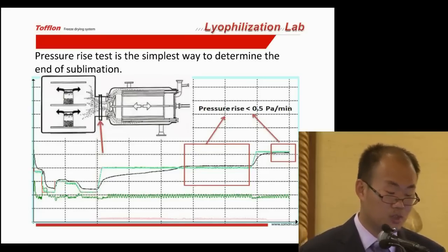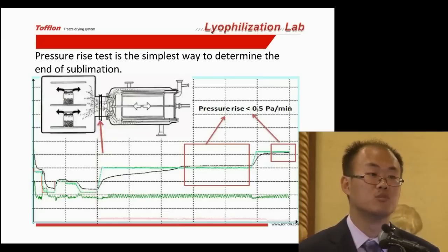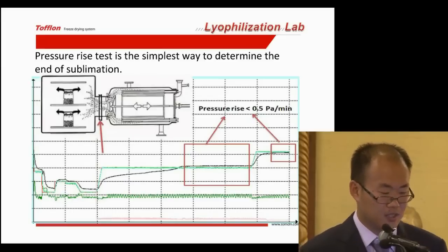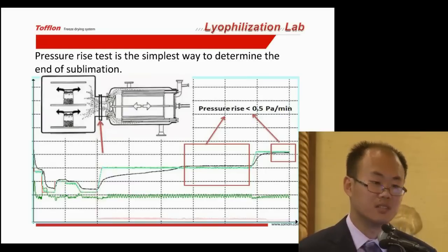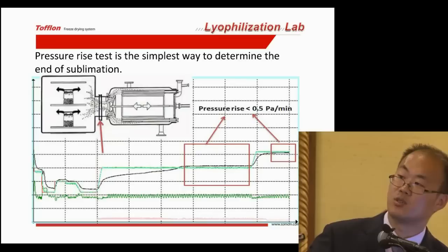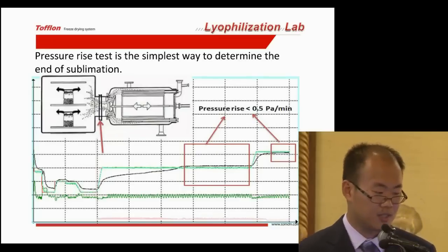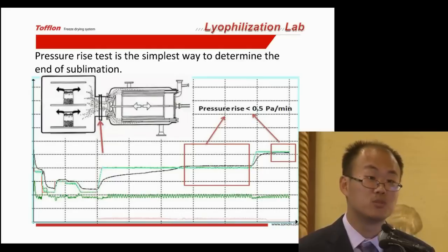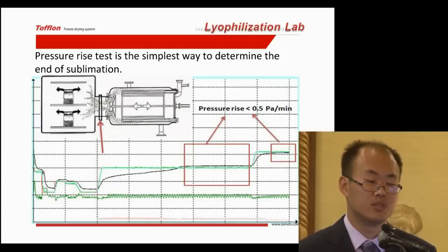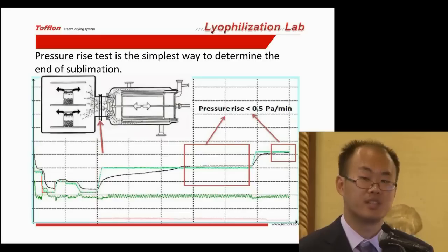So with the vapor movement, we can remove the water continually. We can express this force with this equation: delta P is P1 minus P2 minus P3. Now P3 is the resistance between the front chamber and the back chamber. That is the channel.